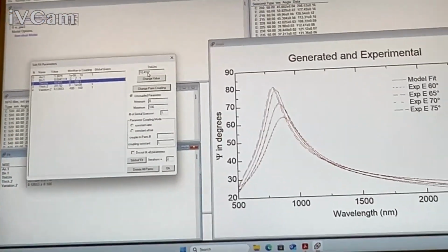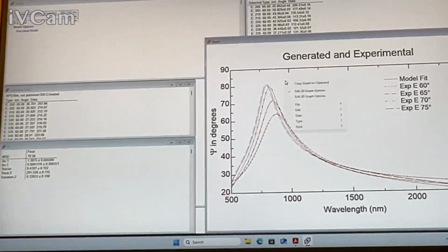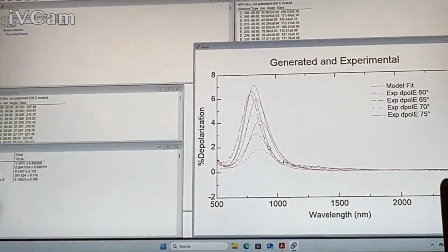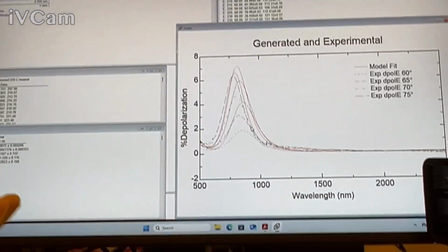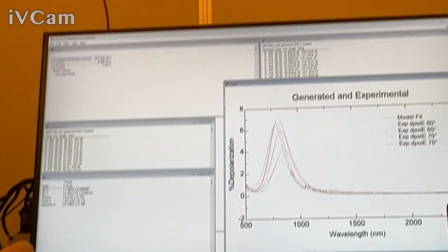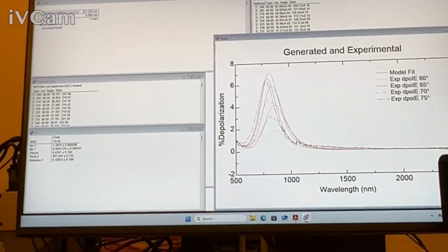The depolarization gives you justification. If I needed to dampen that and had no depolarization, then that would give me more justification to say it's not thickness non-uniformity, but the fact that there's some depol there gives me justification to add the non-ideality. Does that make sense? So you could account for it without the depol. You'd just have less confidence that that's the reason why. Okay. Very cool.